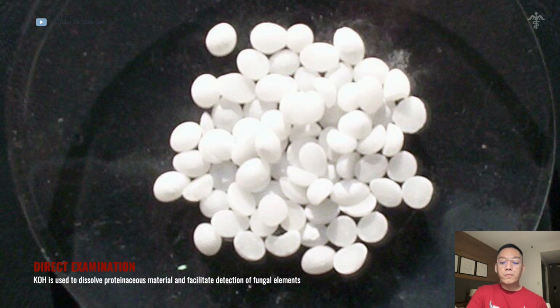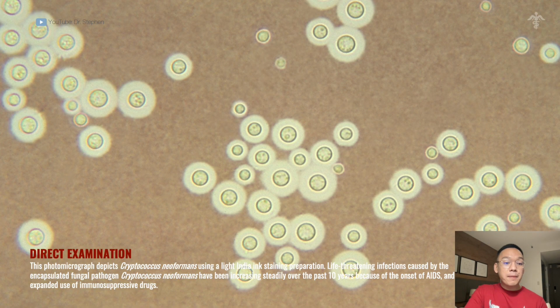Later on, we're going to see how KOH is being used in medical microbiology. With direct examination, India ink is also used. This photomicrograph depicts Cryptococcus neoformans using a light India ink staining preparation.